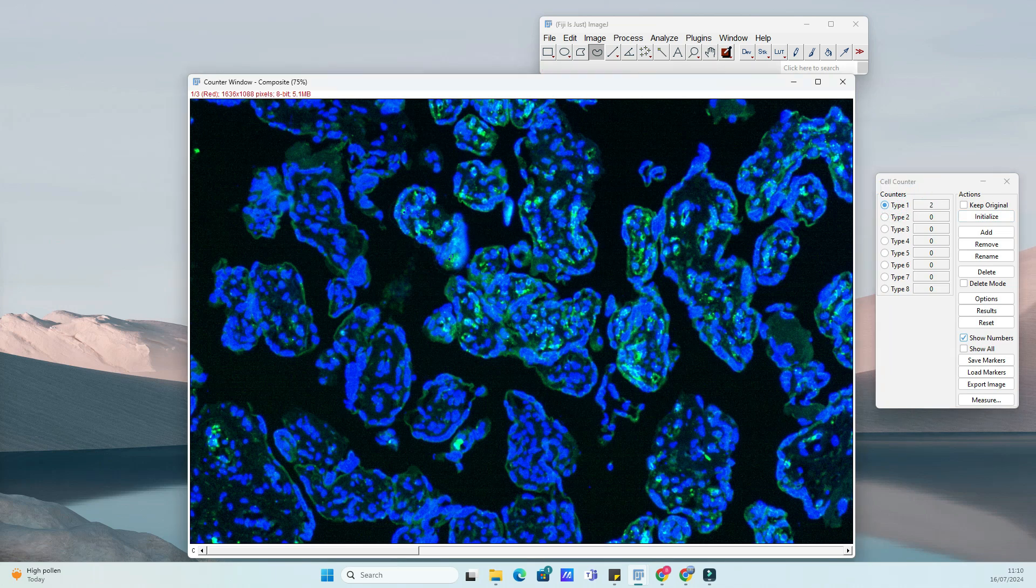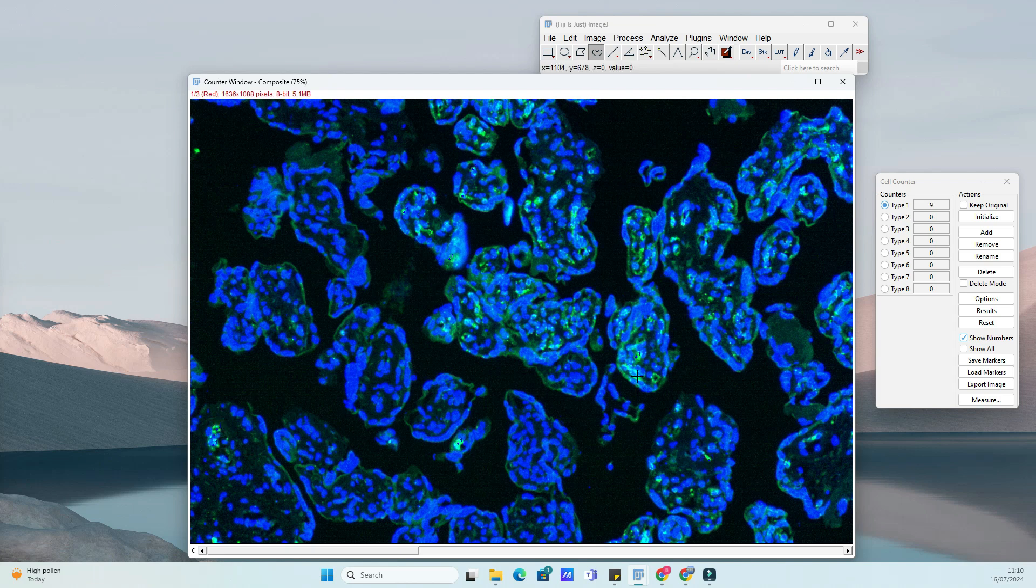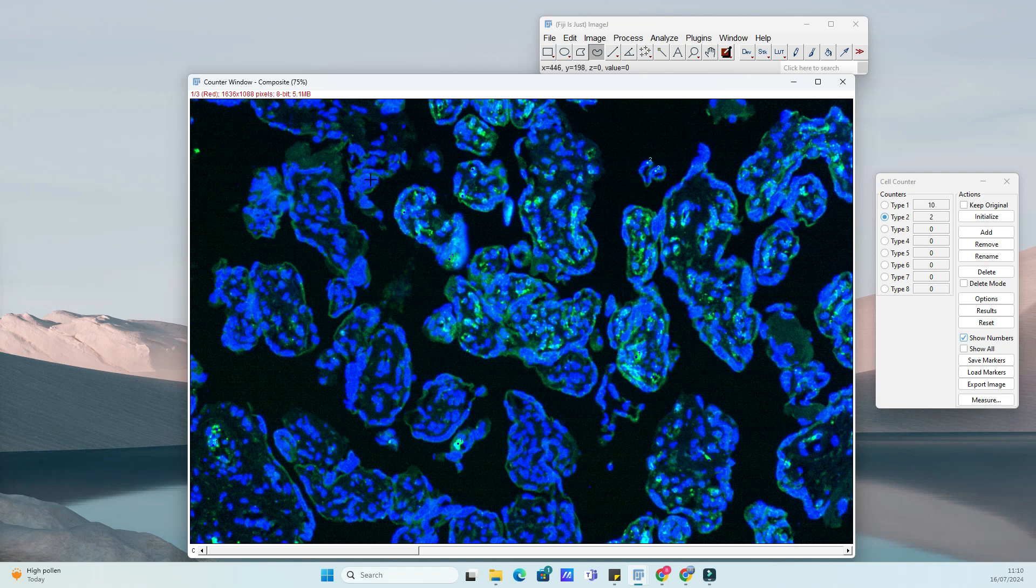Choose from various counting modes, such as Count, Add, Subtract, or Move to suit your analysis needs. Simply click on each cell in the image to mark it. The plugin automatically assigns a unique number to each cell, making it easy to keep track of your counts.